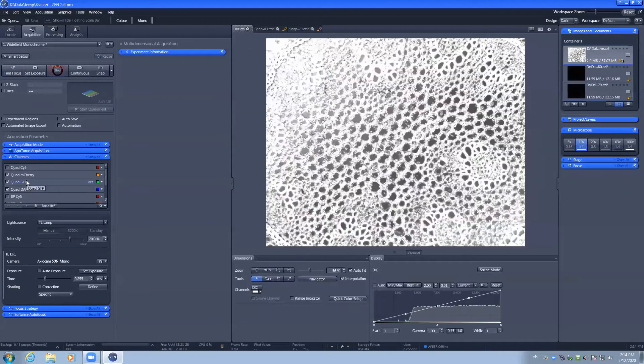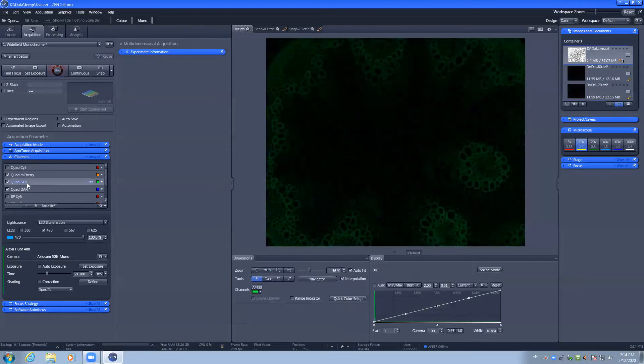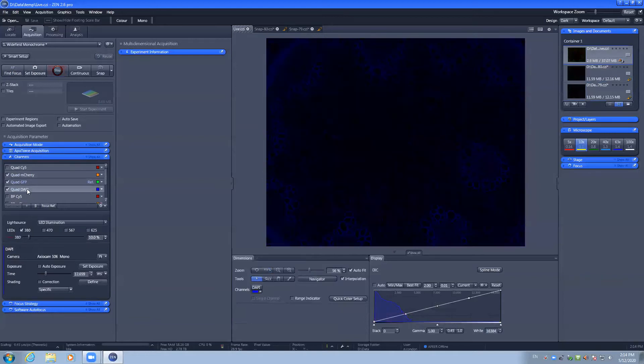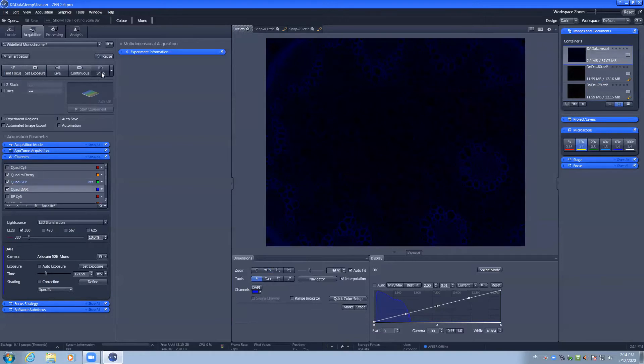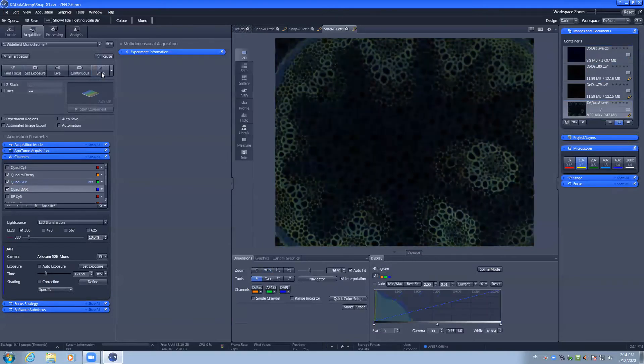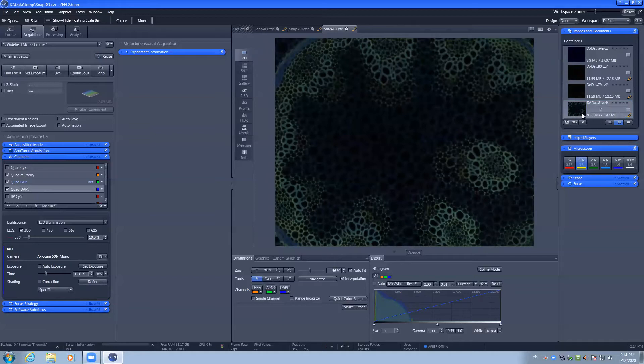I can select Live. For those three channels, they have good illumination. I can then hit Snap and we have a three-channel image in our container on the right-hand side, ready to be saved.